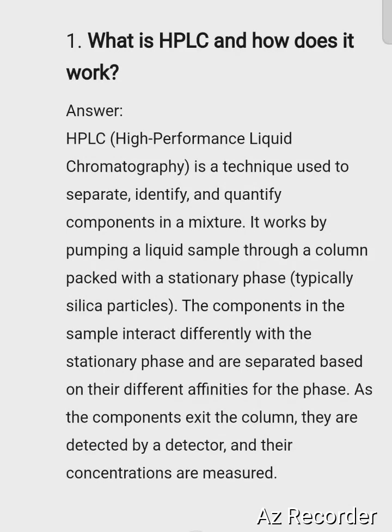Today we are going to discuss the interview questions on HPLC. So let us start one by one. Here the first question is: what is HPLC and how does it work? You have to answer: HPLC is the high performance liquid chromatography technique that is used to identify, separate and quantify the mixture. Now, how does it work?